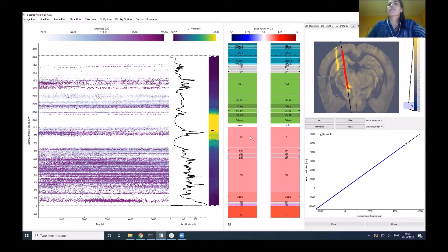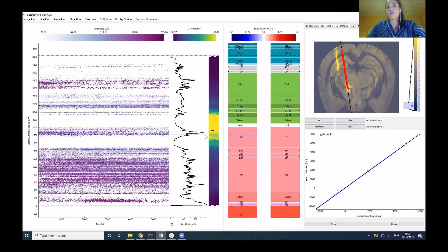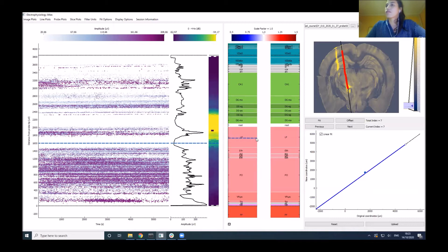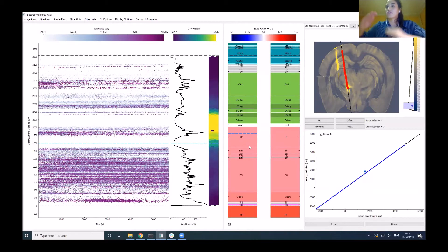Everything is based on reference lines that you can add by double clicking on the display. If you double click, you get a reference line on both the electrophysiology panel and the histology panel, and they move independently of each other. You can use these to align the two columns.